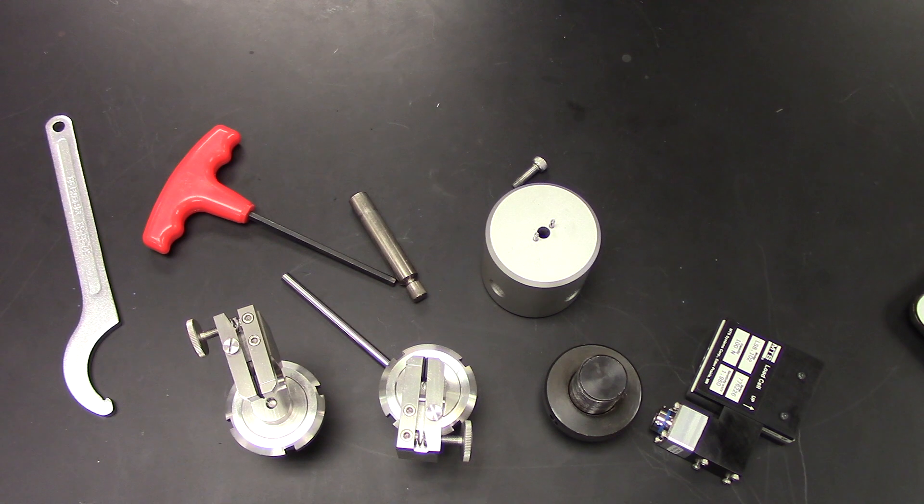Adding grips and load cells for low force testing is a bit different from the high force testing. The most important distinction is that the low force grips and load cells are loaded together rather than separately. For this example, I'm going to connect the 100 newton vice style grip to the 100 newton load cell.